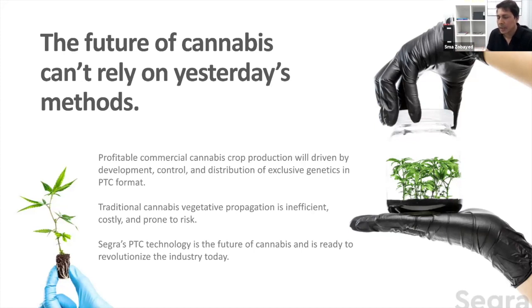In that case, we select, say, 50 plants. So 50 came, 47 came good. We keep the 47, and the rest of the whole population is destroyed. Then we go back and try to multiply from only those 47. If the problem keeps repeating like this, we go back to the mother plant and do the reinitiation.